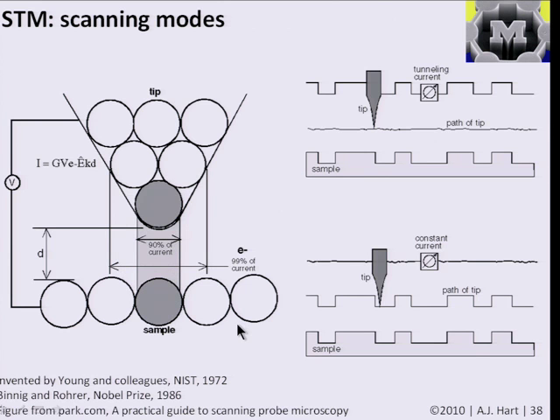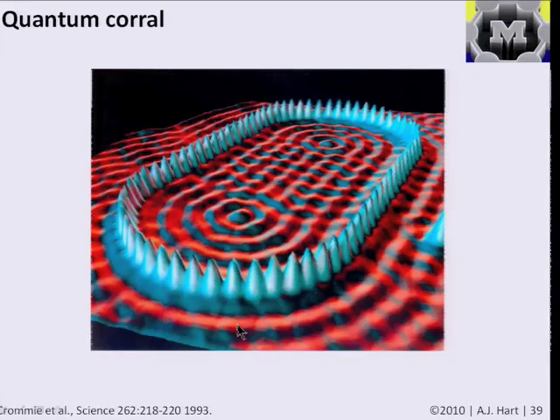And so certainly here you want to have the sharpest tip possible and the smoothest substrate possible, but it's actually possible if you made a very, very sharp metal wire, for example, by breaking it down by applying a very strong current through the wire, and you used off-the-shelf components, you can actually build a sort of benchtop STM that does reasonably well.